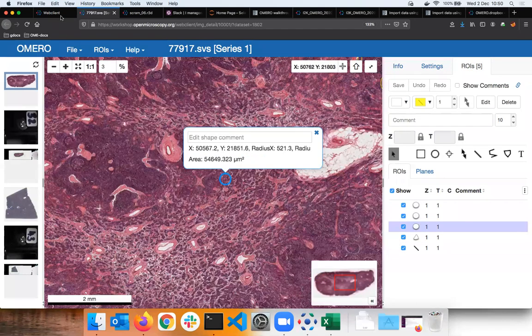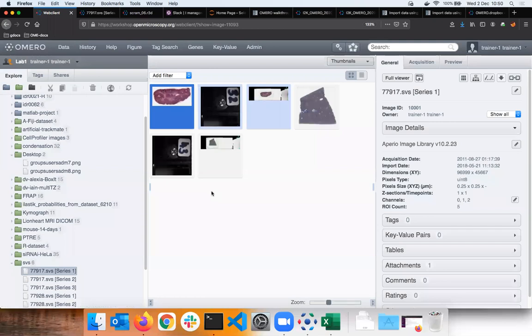Very good. So much for the OMERO.iviewer, and let's now draw our attention to the third-party tools, to the analysis tools. First of all, I remind you what we have here.